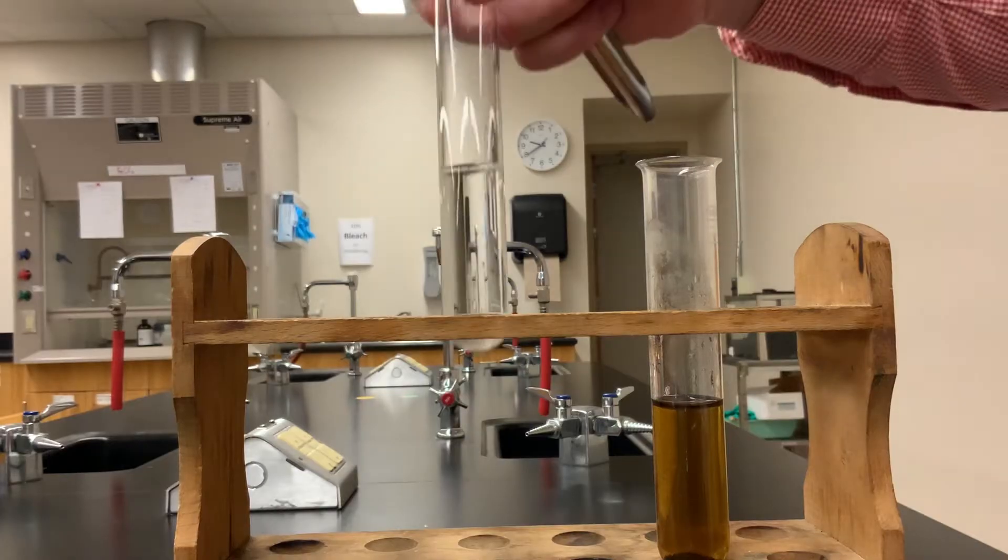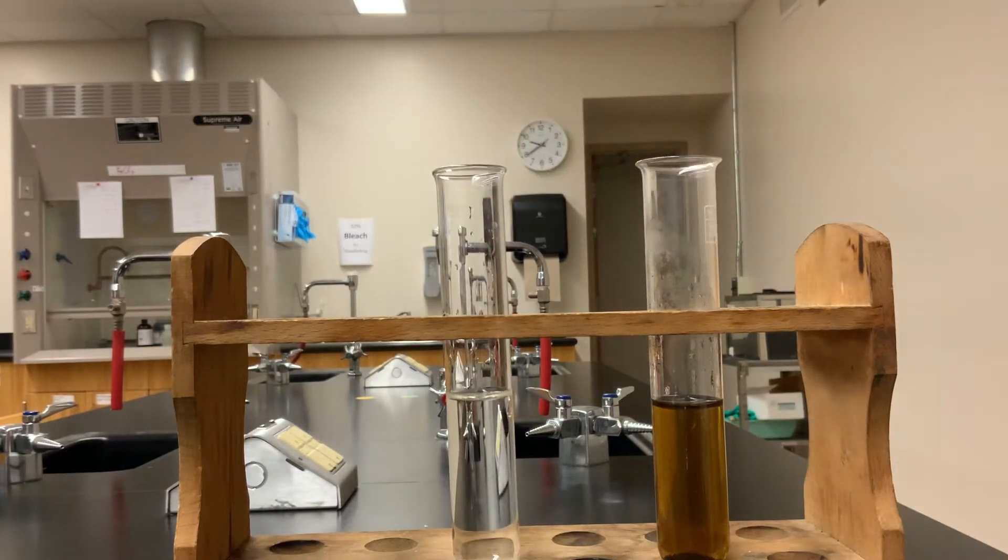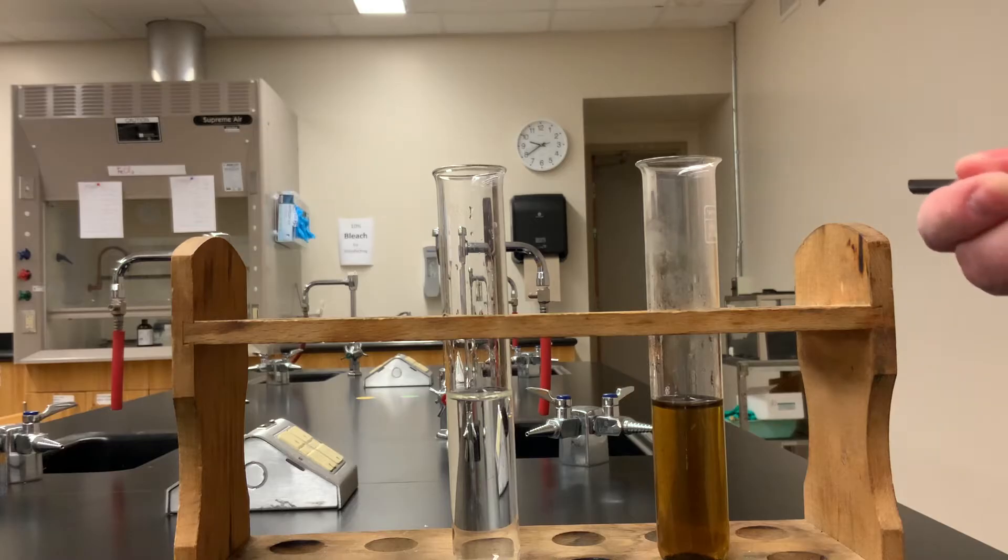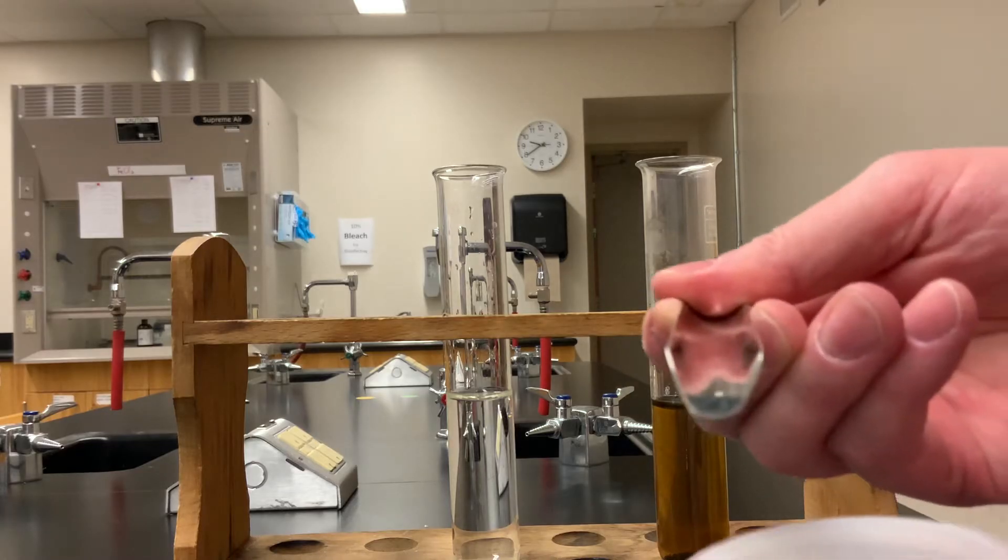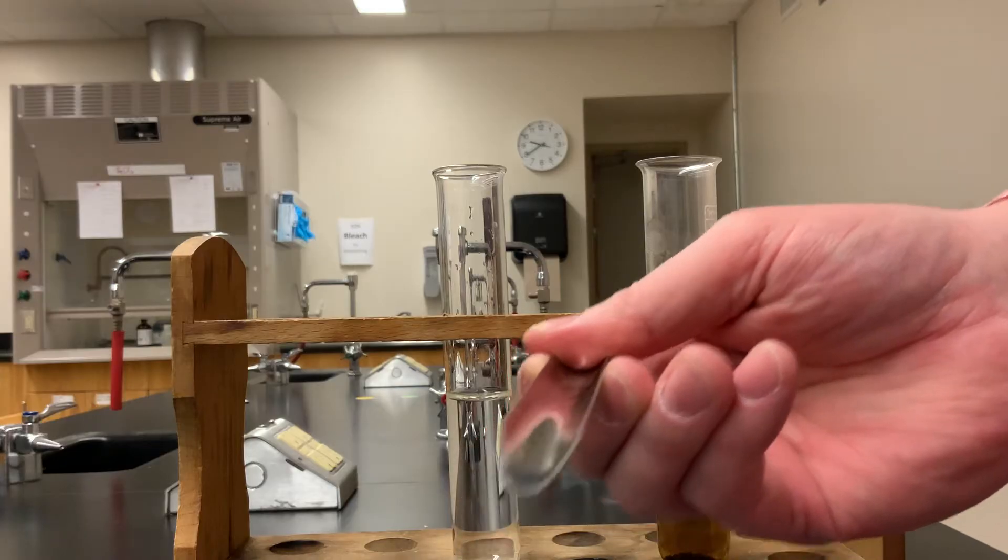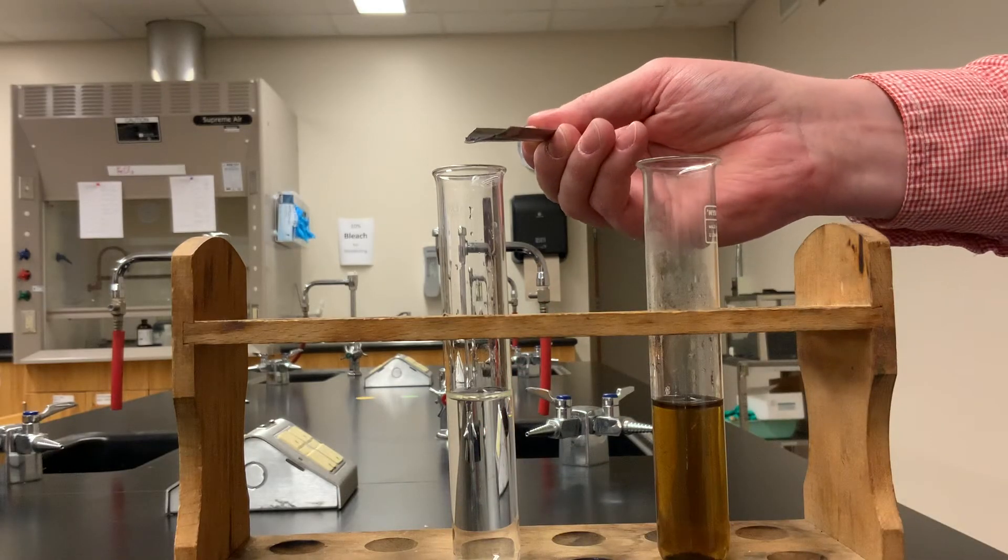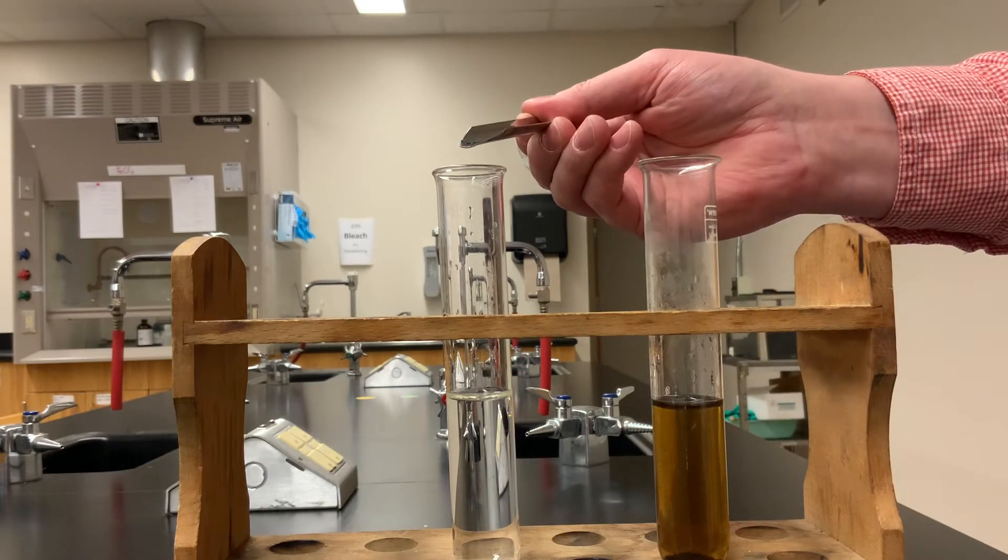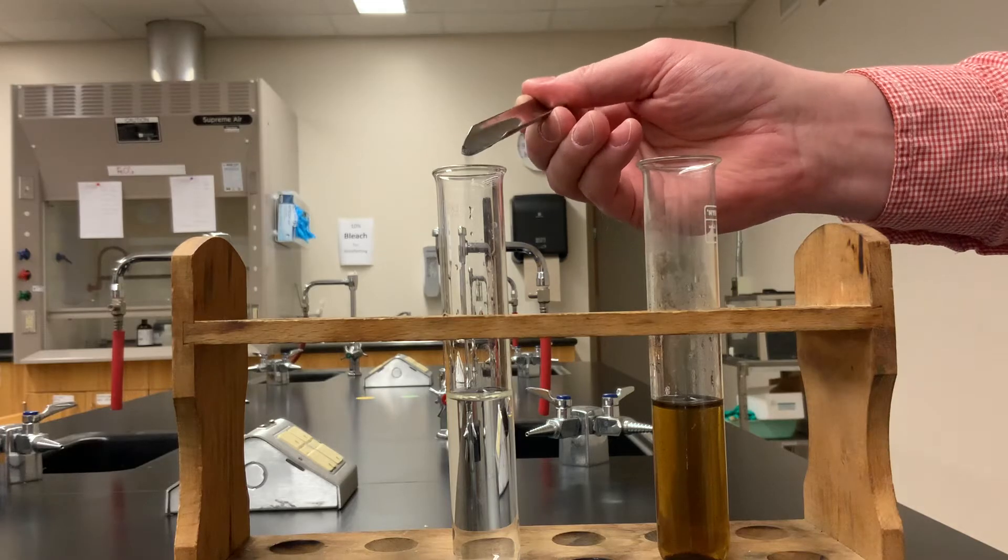So we have a test tube here with 6% hydrogen peroxide, and I'm going to add a small pinch of the potassium permanganate. Just a small pinch on the end of a scoop, add that to the hydrogen peroxide in the test tube.